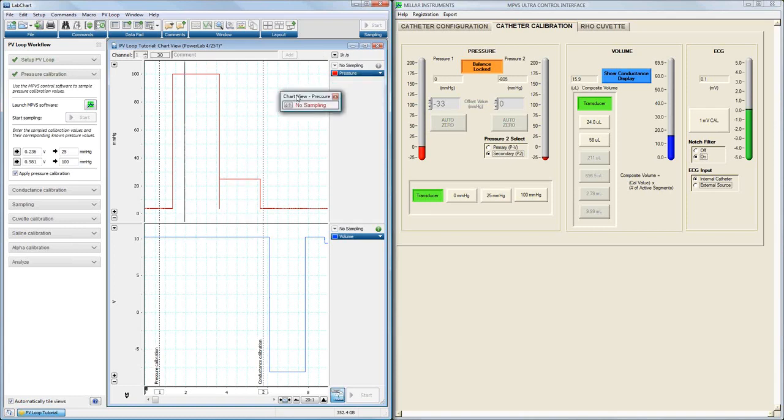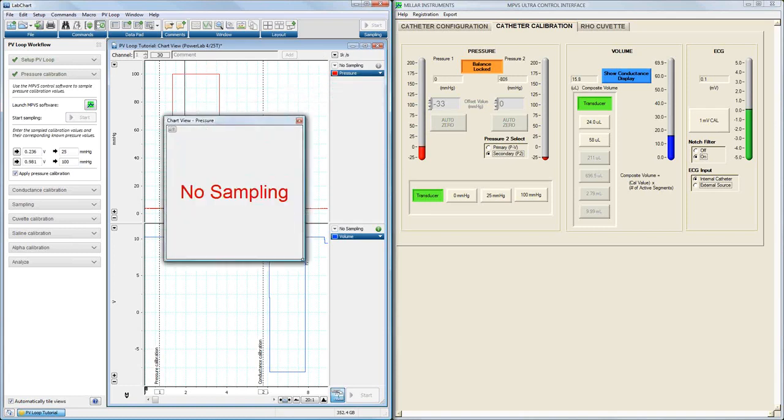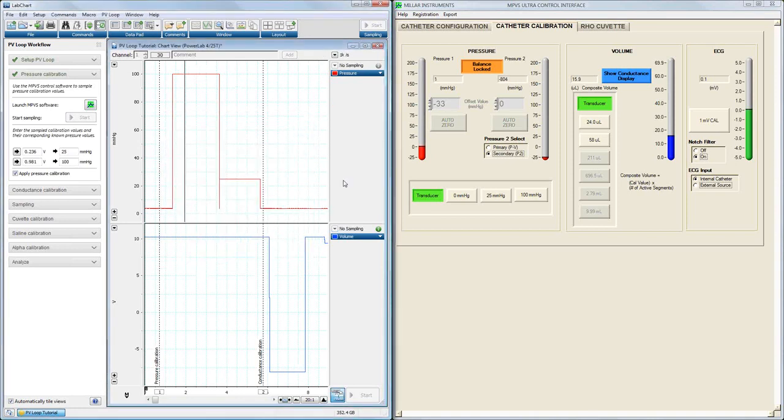And you can see here I'm going to drag out a small digital voltmeter. We are no longer reading in volts. We're reading in millimeters of mercury as I mouse through. This will be exactly the same regardless of whether we're doing small or large animal.